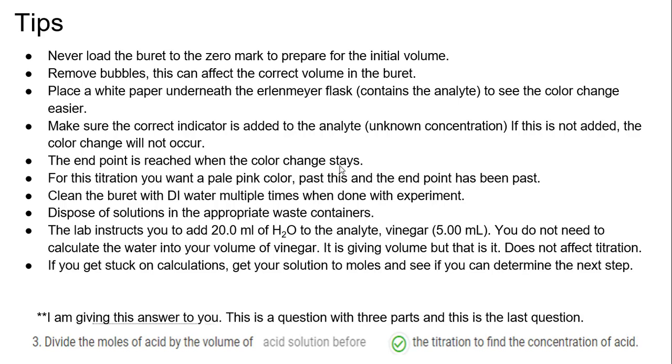make sure you have indicator in your flask, or you will not reach the end point because it will not show. In this titration, you want a pale pink color. You do not want dark pink. Pale, faint pink is the ideal endpoint color. You clean the burette with DI water multiple times when the experiment's done, and you always discard in a waste container. Nothing goes down the sink.